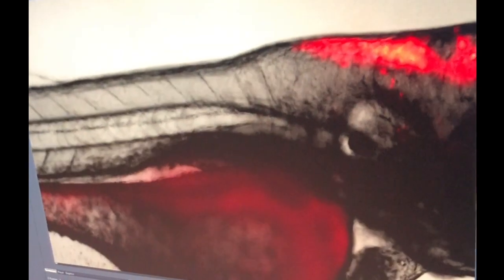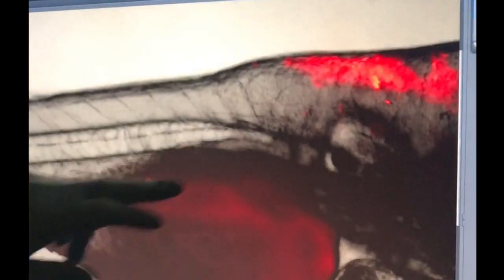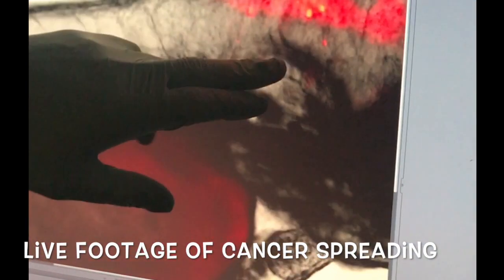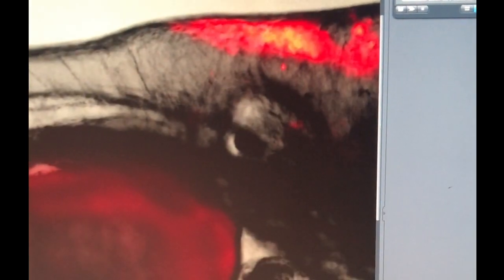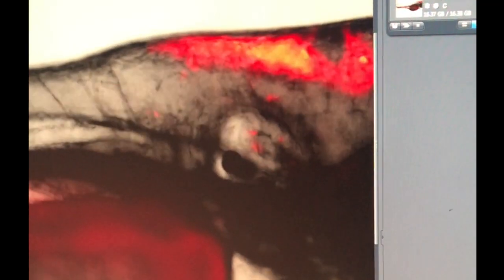So if I can bring this back to the beginning, what's really cool about this video is you'll actually see one cell come out and travel down, but then it will go back and actually recruit about 4 or 5 other cells, and then you'll see them drop down as a clump. That's amazing. Which is really cool. So there's some sort of cell signaling going on there, and it's cool because we can actually visualize this.